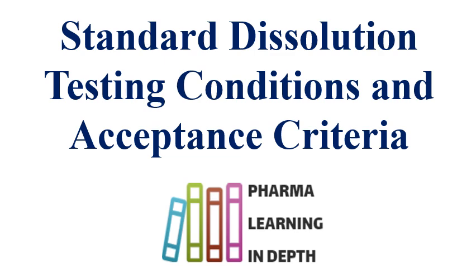So from the initiation phase or research phase, the dissolution testing parameters and acceptance criteria are required to be finalized, and on that finalized method only, the stability studies are required to be performed. Otherwise, there may be queries on the dissolution method development and the acceptance criteria.